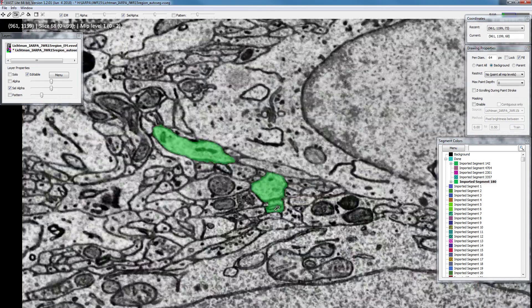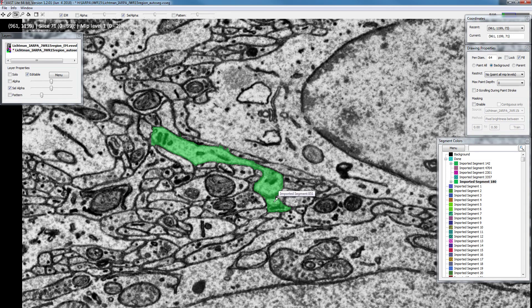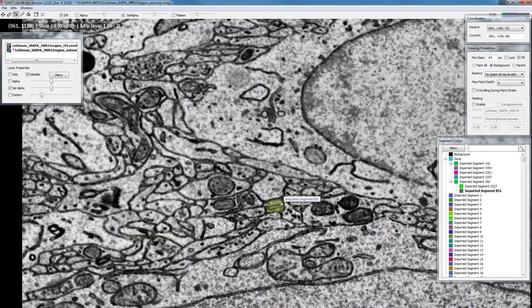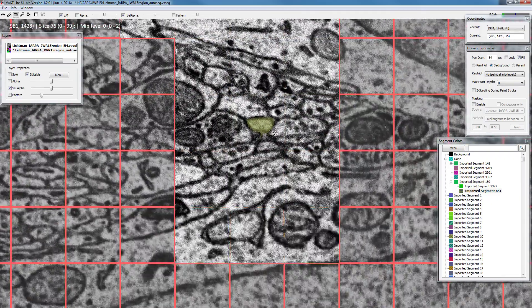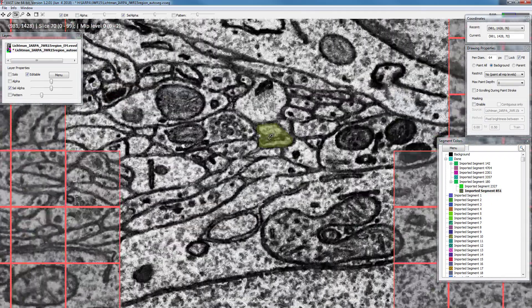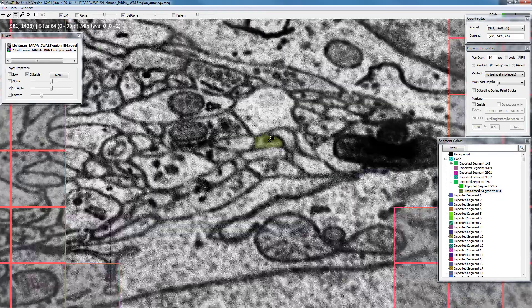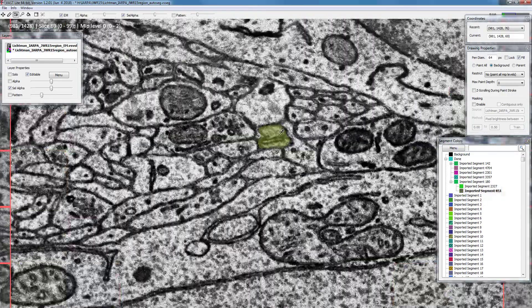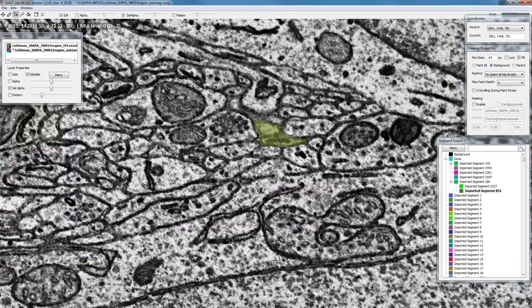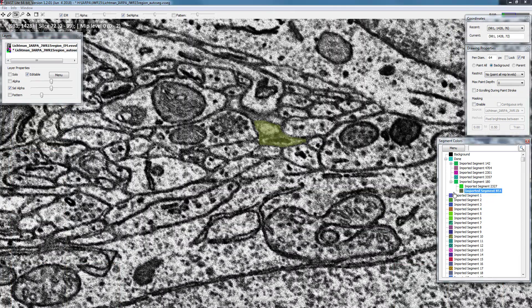Right now, segment 851 here is the spine I added, and this object is also 851 — which it shouldn't be, it's just the axon. I will correct that by painting. Once you paint you have to make sure you are at the desired mip level — for collecting it doesn't matter, but for painting it does. So I'm going to add another segment because we want to split this off as a different color.